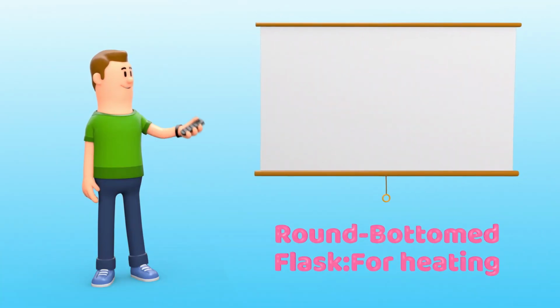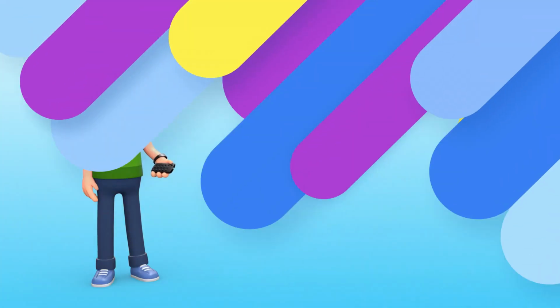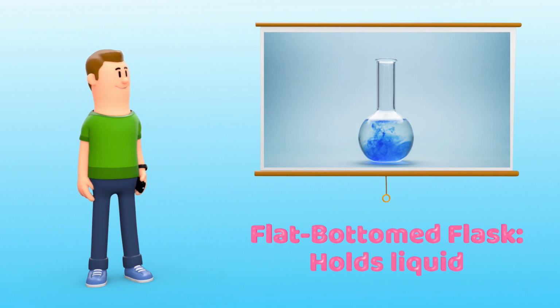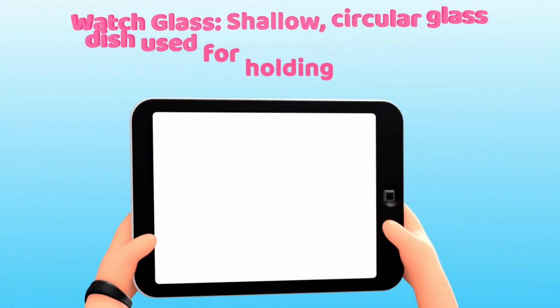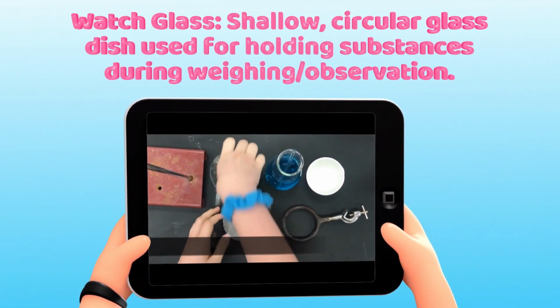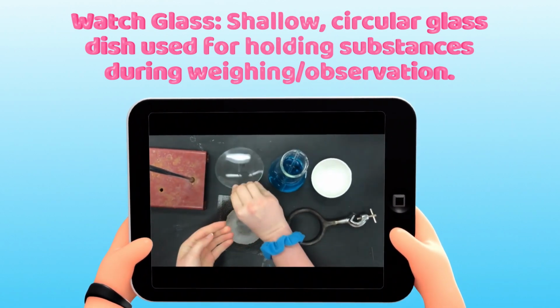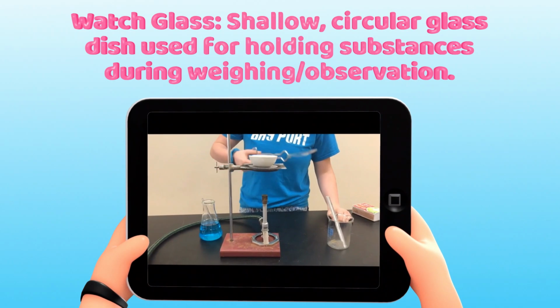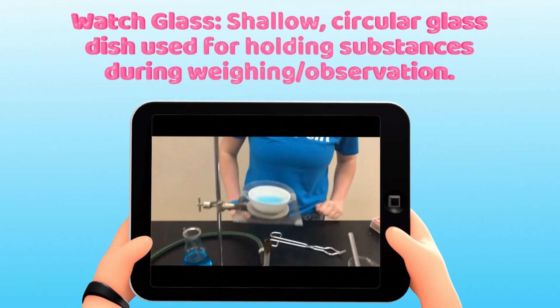The fourth type is the round-bottomed flask, which is used for heating chemicals. The last type is the flat-bottomed flask. This is used for holding liquid chemicals. Another apparatus is the watch glass. A watch glass is a shallow, circular glass dish used for holding substances during weighing or observation, as you can see on the screen.